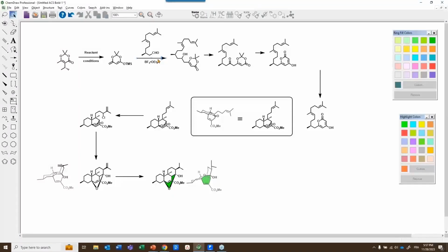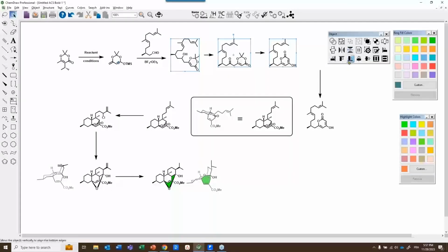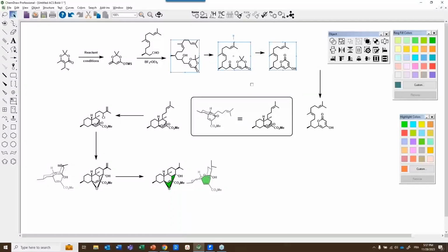So to clean this up, I would do a succession of those steps, and then potentially, depending on the scaffold that you are working with, you go to View, Object Toolbar, and maybe align the bottom edges or align the top and bottom centers, right? That really depends on the scaffold that you are working on, to make things look nice on a reaction basis. Okay.